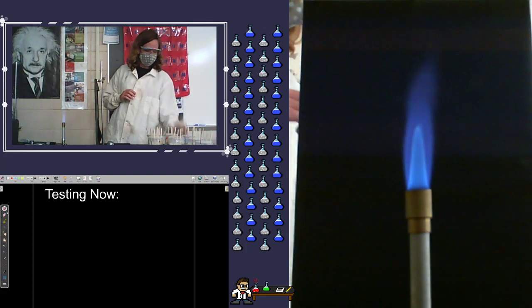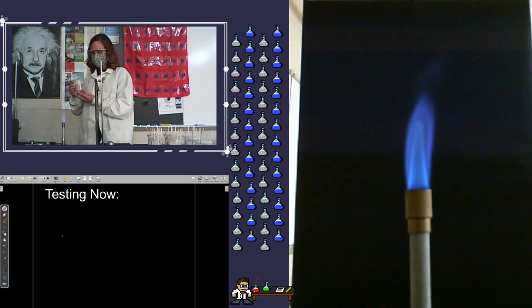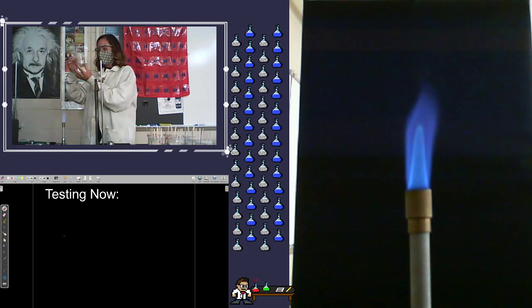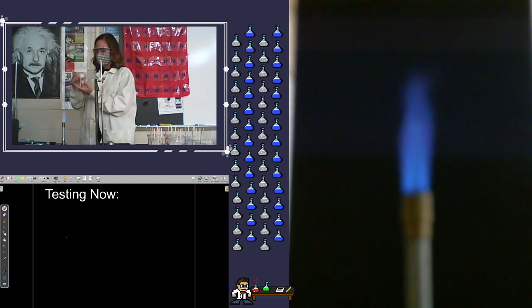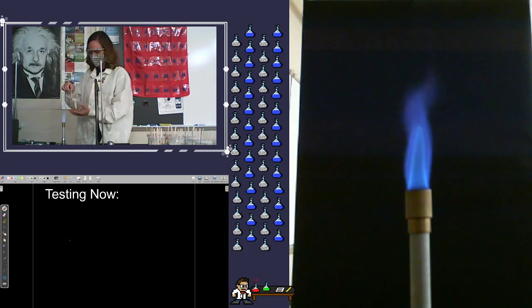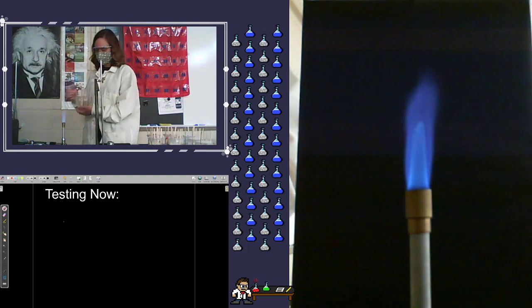Okay, here is another one that is also a lot of people's favorites. We've got a kind of slightly yellowish solution. What's it called? Potassium nitrate.